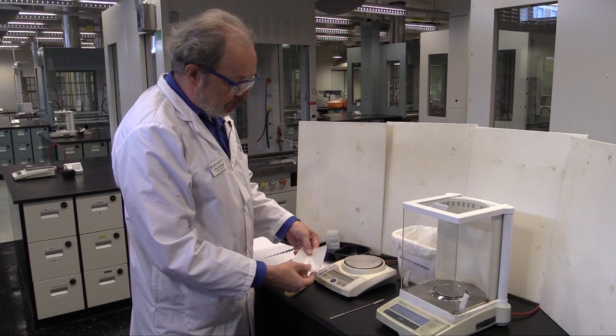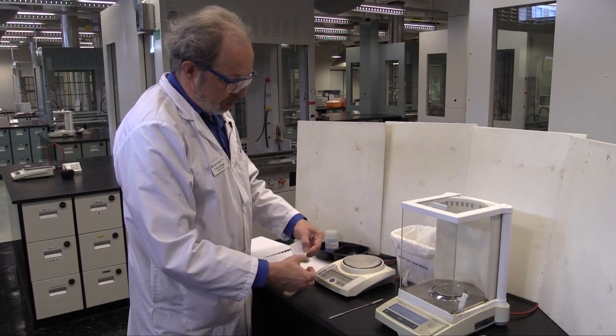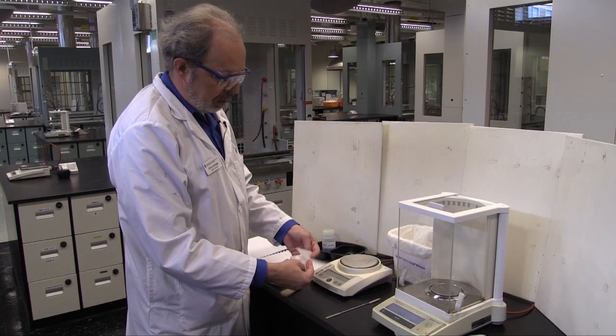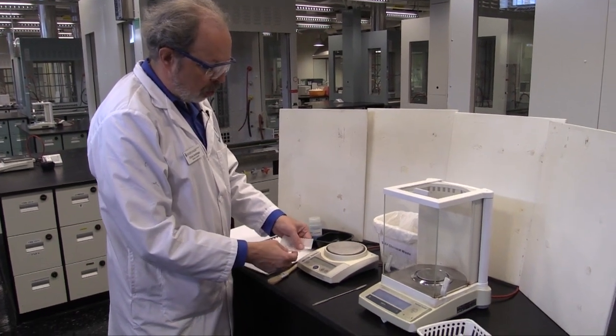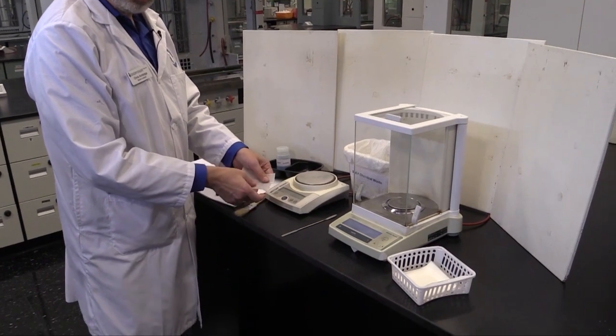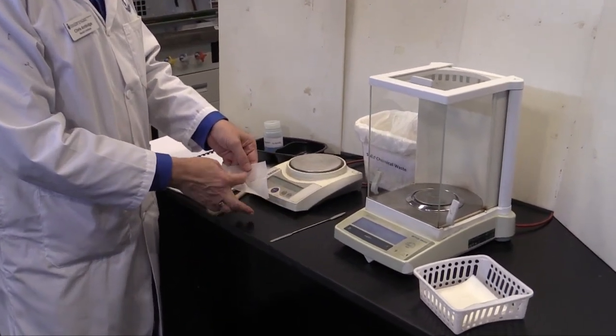These are actually disposable. When you've got one, crease it a couple of times diagonally across and that will cause a well where the chemical that you're weighing out will actually gather.